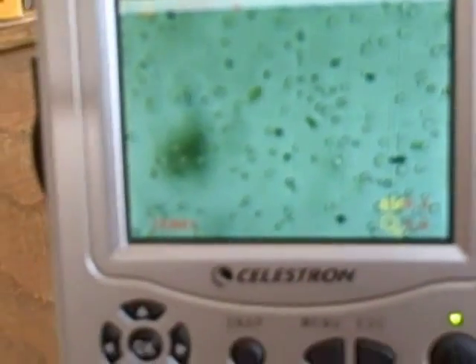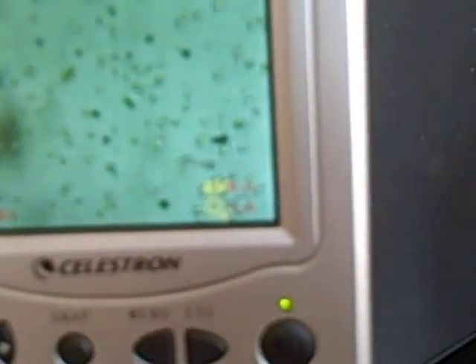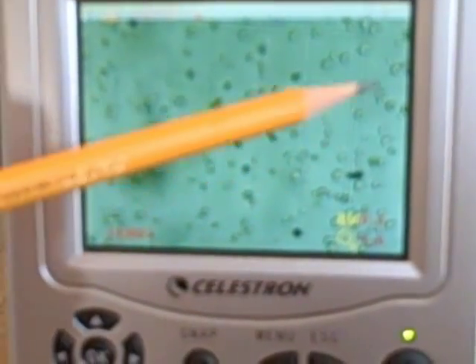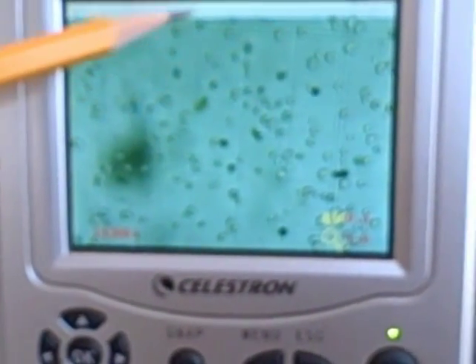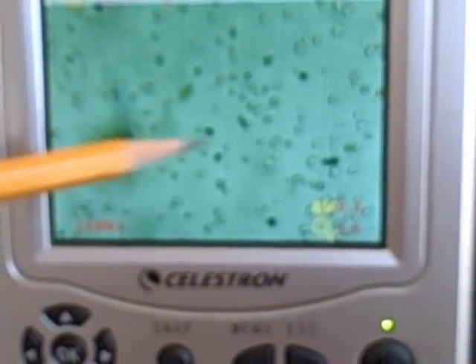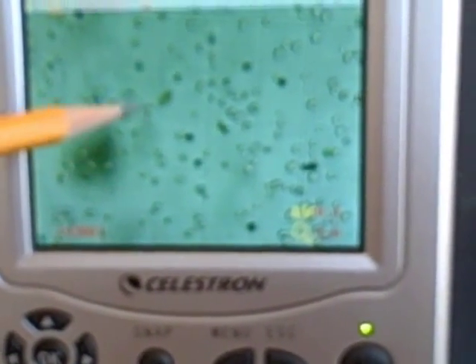I finally adjusted it. I don't know if you can see that any better now. Here's a grid pattern. I'm not sure how clear that's coming in, but you can really see the lines. Now you can see pretty much the grid and what you would be counting. I just had to adjust it, but if that makes sense, that's kind of what you're seeing.